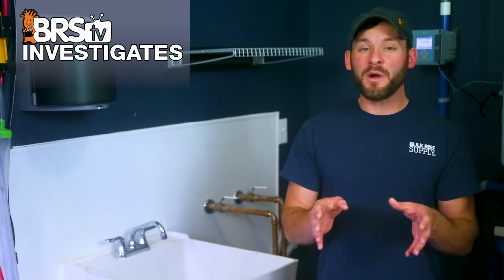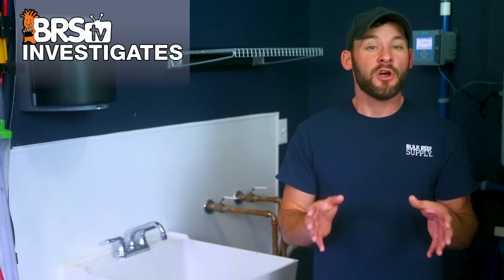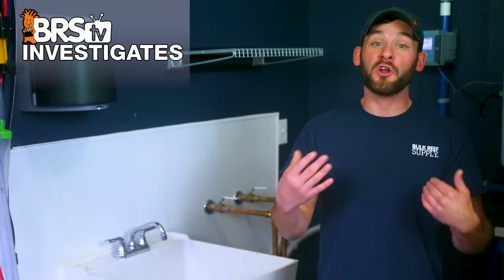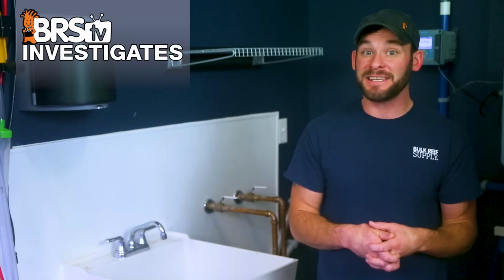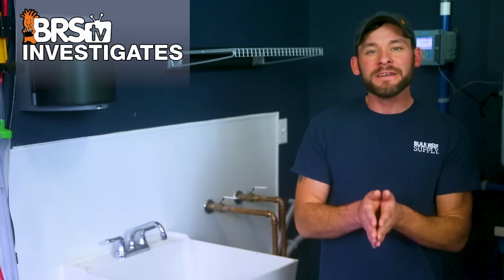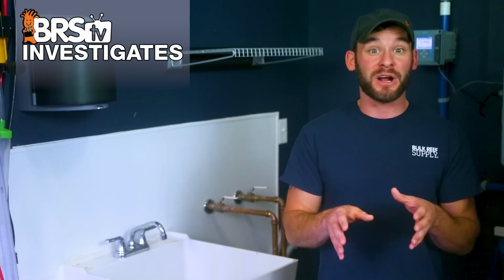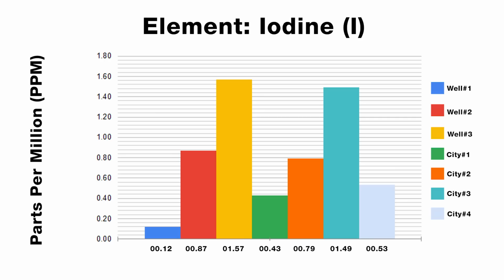So it's tough to say whether these copper levels were derived directly from the water sources themselves, or if the type of plumbing may have contributed, or maybe something different altogether. The important thing to note here is that because we tested with ICP for these water sources, we are now more informed as to the levels of copper present, and regardless of proximity, it seems no 2 water sources are the same.